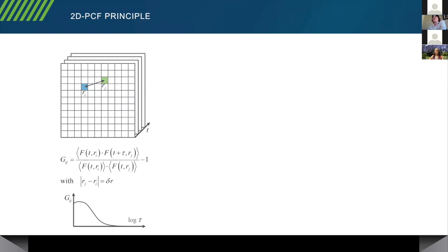And so what do we get there as a function of the delay time? Well, first the autocorrelation amplitude increases, and then over longer times it will go down to 0. So what does that mean? Well, what we're looking at are fluctuations caused by molecules that are moving around while we are taking this image time stack. So what will happen, we have a molecule at position Ri, which then as a function of time can diffuse or migrate to the position Rj, which means it increases the likelihood of finding it over there. So the correlation amplitude first increases, but then the molecule will move further away from both of these points and eventually be so far away that the overall probability to find it in the same spot goes down to 0.